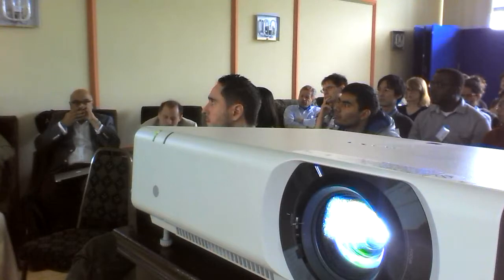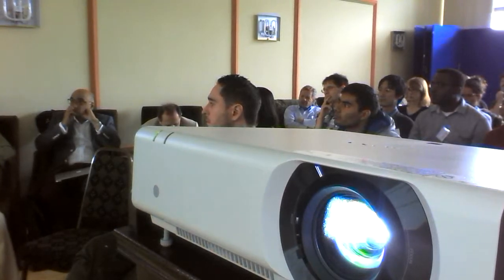So at the moment, we're in Italy. We're setting up this system where we're using a 25 element avalanche photodiode array, and exactly the optimum way to process all the information from those pixels is not clear yet to us. But the Zeiss use a 32 element photo multiplier array. But you're quite right that there should be some 3D information there that we can use.